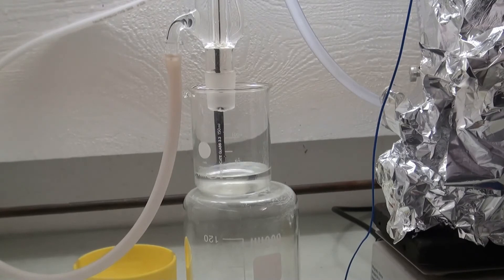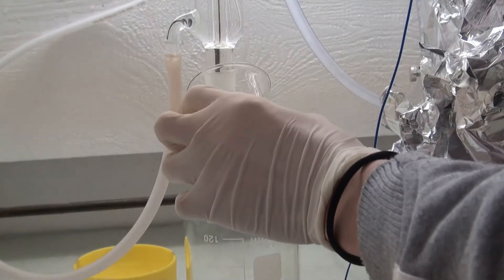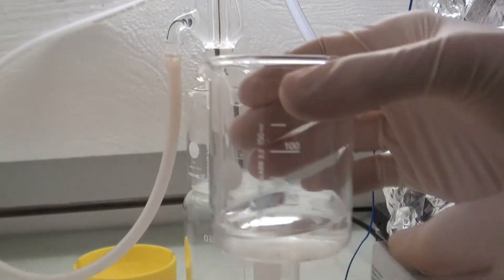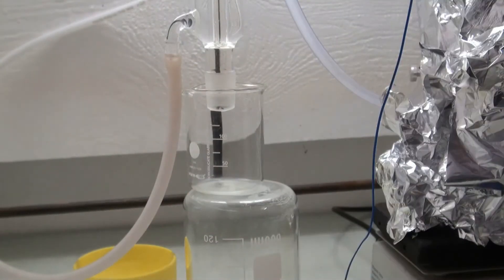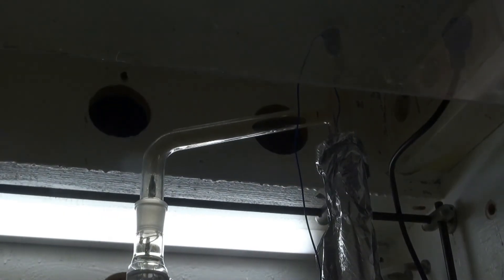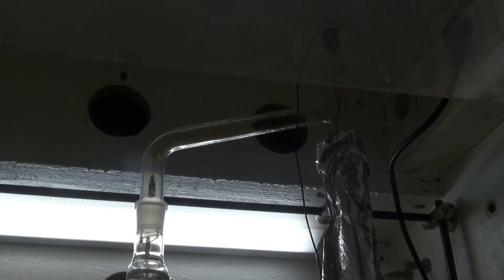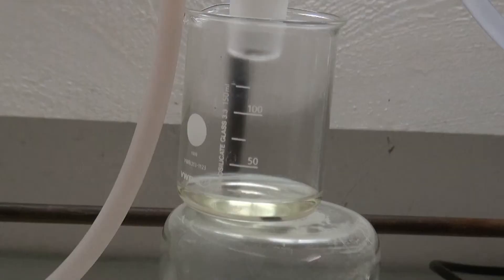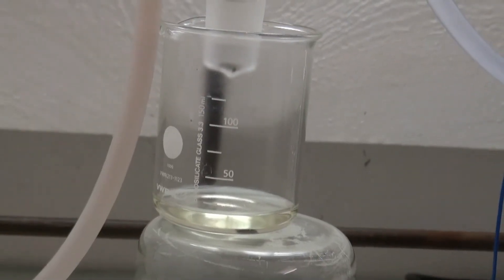After two more hours the temperature had reached 120C, and the collection beaker was changed to collect the azeotropic nitric acid. The distilling arm also started to be filled with nitrogen dioxide, and the distillate coming over became slightly yellow.